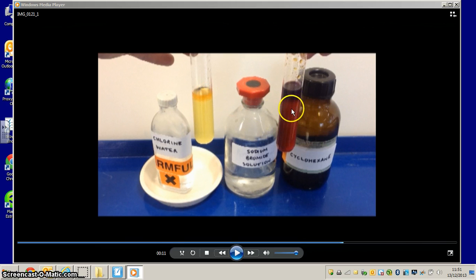And this tube over here is actually the same experiment, but instead of starting with sodium bromide, I've started with sodium iodide, and exactly the same will happen. Chlorine, being more reactive, will displace iodide, so we end up again with a sodium chloride solution in here, but the iodide will now become iodine, and the iodine will then dissolve in the organic solvent on the top, and you can see it's a very deep purple here.